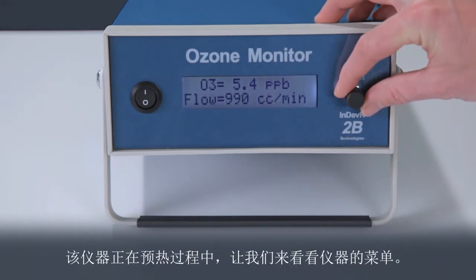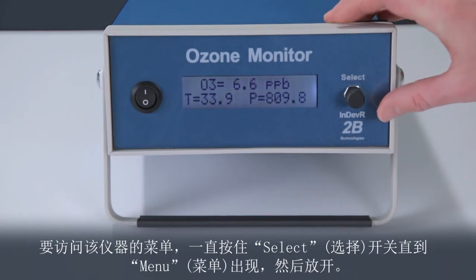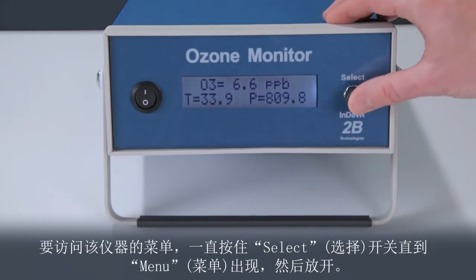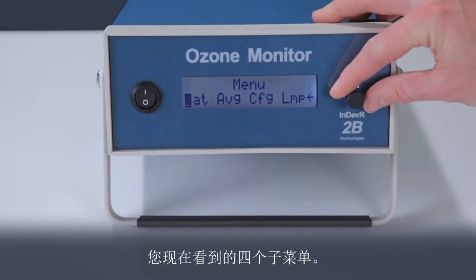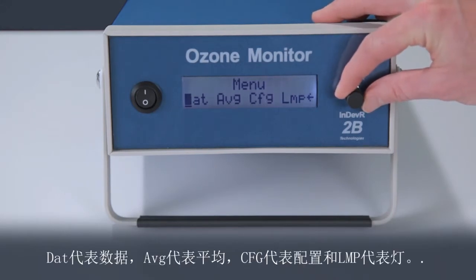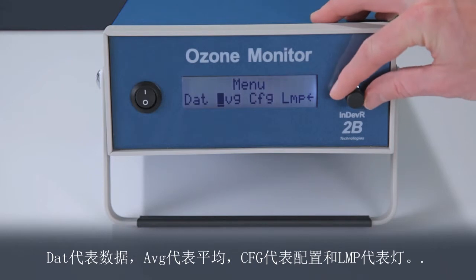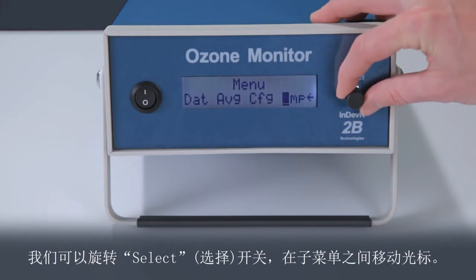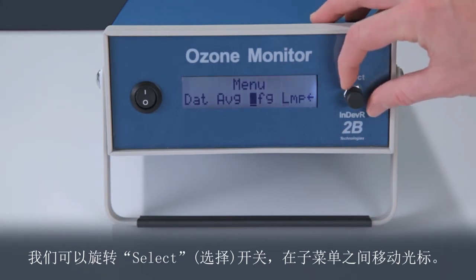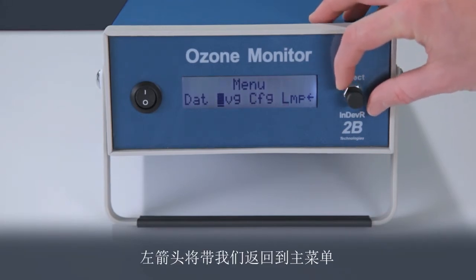While the instrument is warming up, let's explore the menu. To access the menu, hold the select switch until the word menu appears and release. You now see four submenus: DAT stands for data, AVG is for average, CFG is configure, and LMP is for the lamp. We can rotate the select switch to move the cursor between submenus. The left arrow will return us to the main menu.